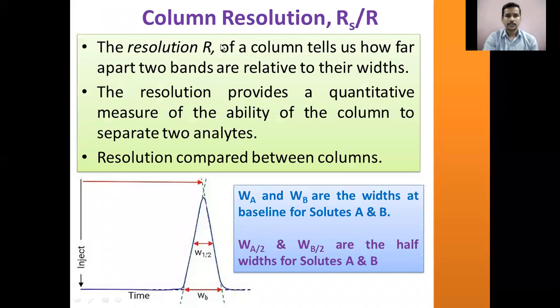And one more thing is resolution, column resolution. Resolution comes into the picture whenever we are in a position to separate two solutes.